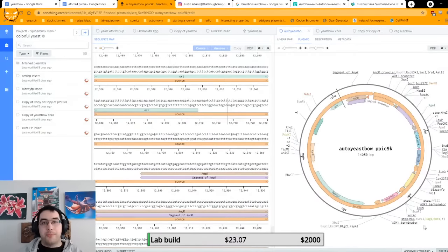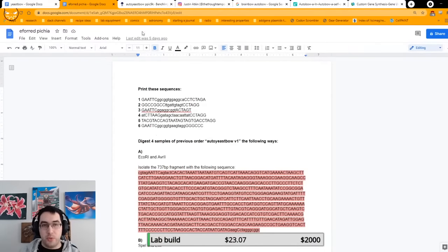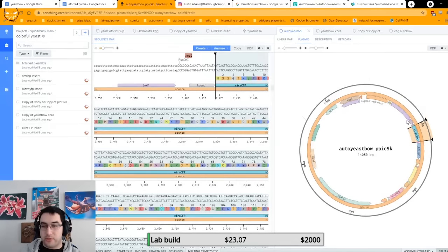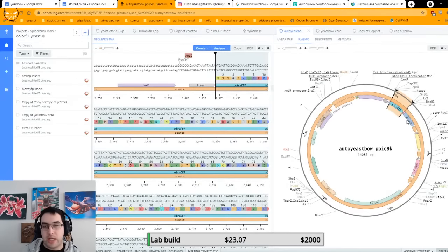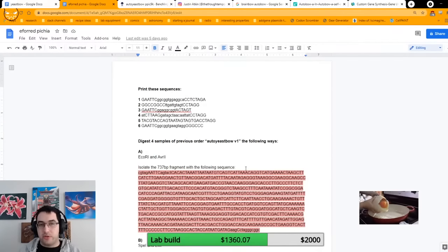Okay, cool. So with that said, and this covered, that's this. Now, like I said, I put restriction sites on the edges of every single one of these proteins. So I've already done most of the work for this, because this took me like an hour. So basically what I want them to do is take this printed thing, and essentially cut it to ribbons. And I want them to isolate each of the individual fluorescent proteins or chromoproteins, and then stick them into their own backbones. So let me show you what the synth file looks like. And this isn't finished, and we're going to finish it on stream, just so you can see what's up.